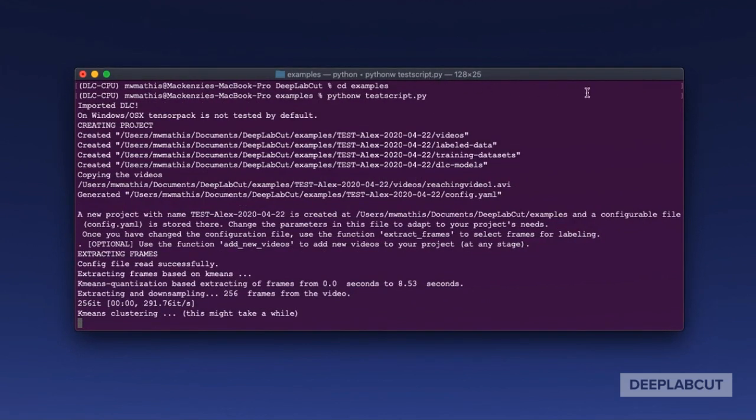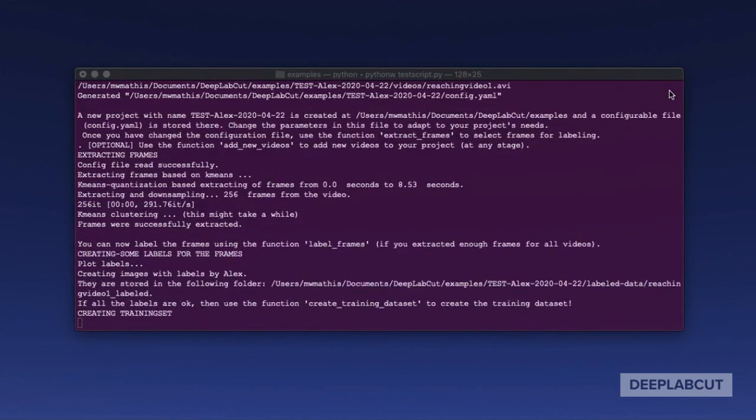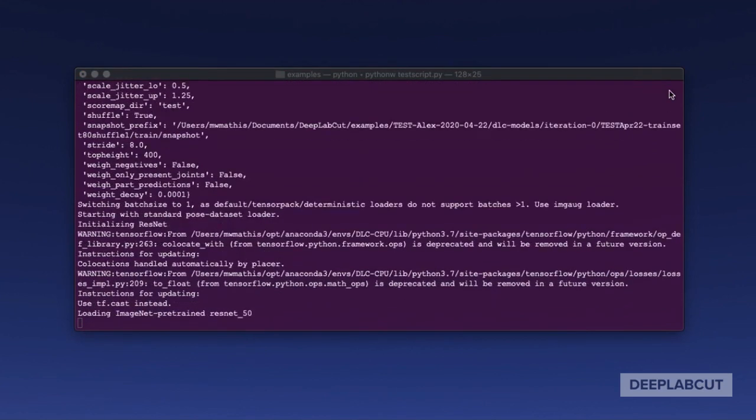While this test script produces nothing of interest scientifically, it allows you in about two and a half minutes on the CPU to test all the major functionalities of DeepLabCut.